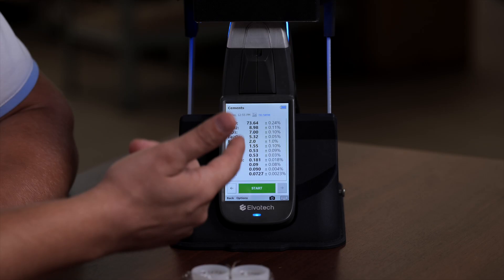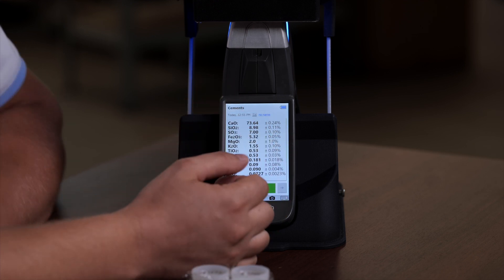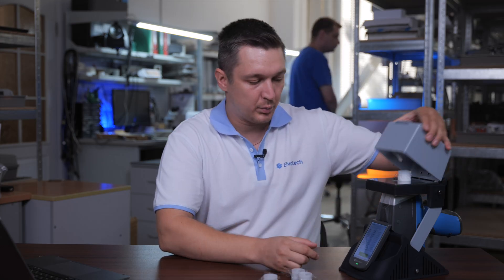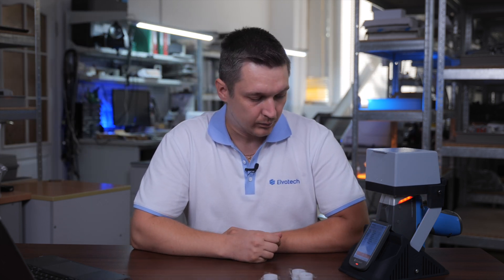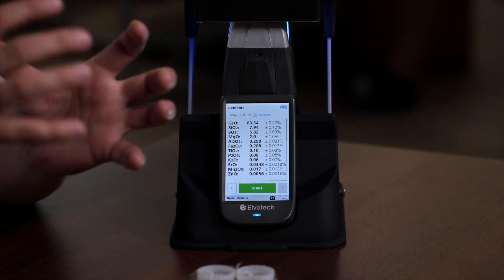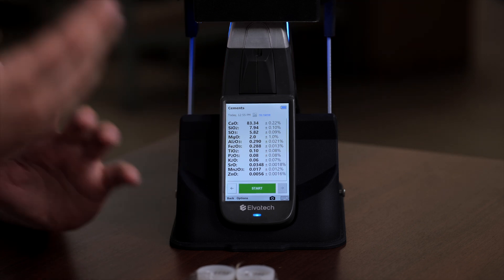As you have seen, the analysis is very quick and accurate. And now we can see on the screen the composition of our first sample. Now we just place our second sample and push the start button. 10 seconds and the second analysis is finished. If you want a more precise analysis, you can set the duration longer than 10 seconds, but for fast screening, 10 seconds is enough.